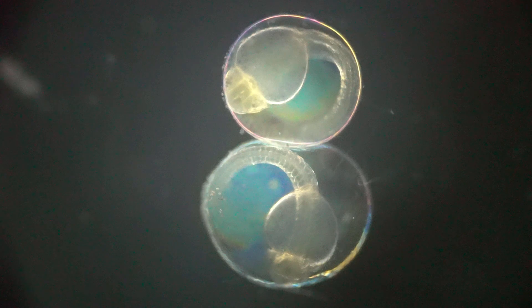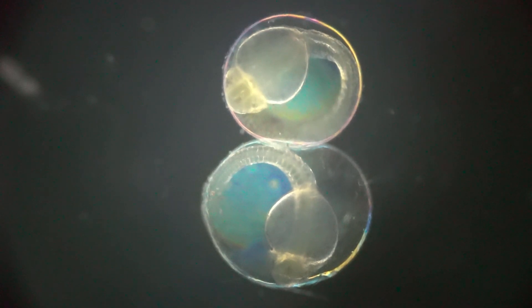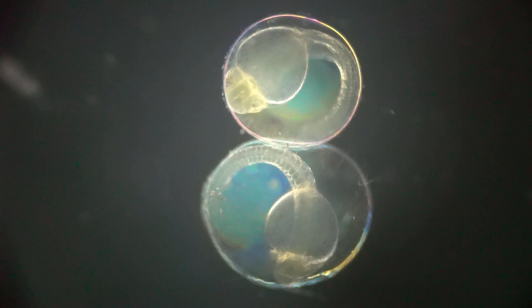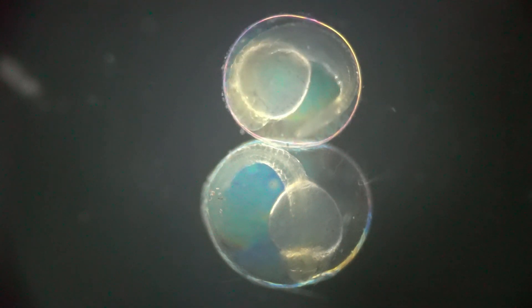Now I also had to go to work all day so for about ten hours I was gone. So we have to skip forward another ten hours to these images here and you can see that these fry are just minutes or hours away from hatching. They're definitely moving around a lot more. You can definitely see that the head and the eyes are starting to develop as well as a little bit more of a defined tail.